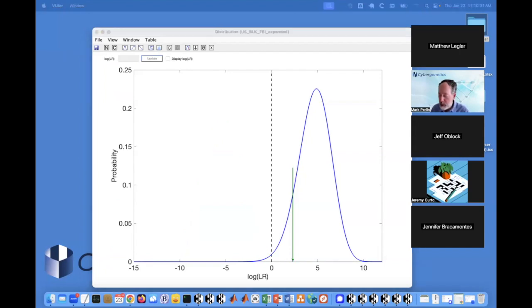Thanks. And so what the contributor distribution is: when you compute a genotype, there's a true contributor. There's a true genotype, a person who generated this. But given that in science we're working with probabilities, unless you have an exact single source profile that's perfect, when you make comparisons, what you're looking at is, if you were to look at all possible genotypes, these are the likelihood ratios that you would get when you compare this evidence genotype with the correct person.